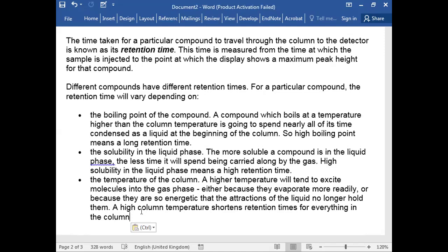Non-polar high boiling point liquid, मैंने कहा ना wax, you can visualize a wax coated on a diatomaceous earth. मैंने कहा rocks पे समझो you have coated, उसी की explanation है ये. वो तीन है कि क्या हो सकता है if I let go of a component, या तो it is in the gas phase, या तो it condenses, or it interacts with the stationary phase, उसके अंदर dissolve ना हो जाए.